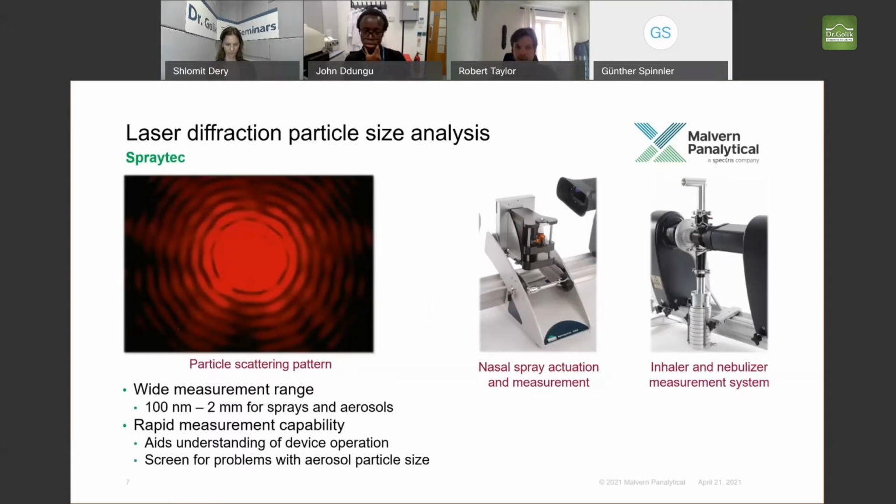Okay, and so the position and intensity of these lobes can then be related back to the particle size distribution of the material itself. So all you do is you take a cross section of this, determine the angle at which these lobes are emerging and the intensity, and you can infer the particle size distribution.